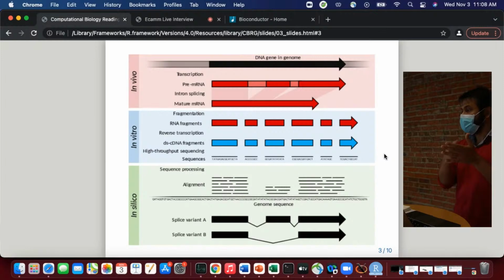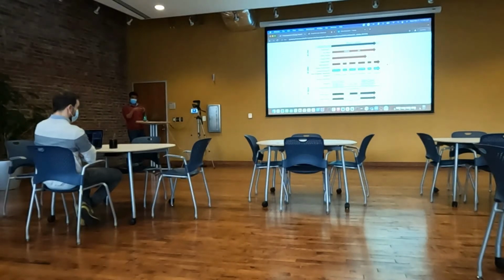That's a lot, and we will actually be skipping a lot of the pre-processing steps, going from the machine, from the raw sequences, to quality control, to aligning them, and all of that. What we will begin with are the count data, the raw counts for each gene. The steps that lead to this are also interesting and something we can revisit at a later point, but I think this is the more interesting part. Oftentimes you will get data in count form from a core facility, so I think this is a good place to start.